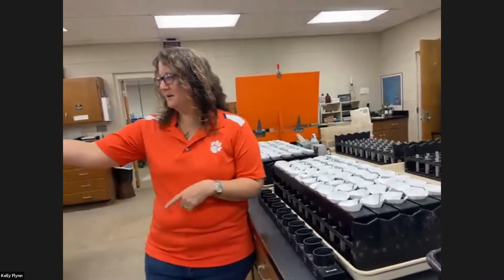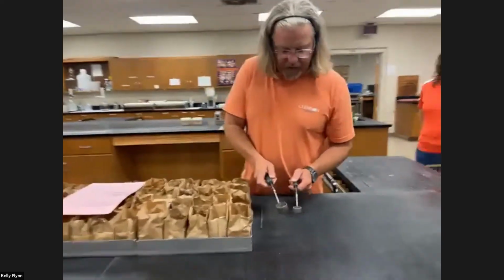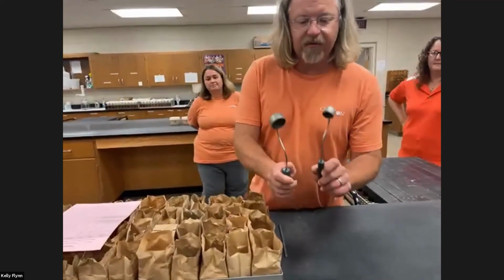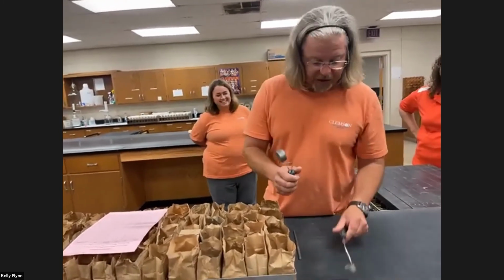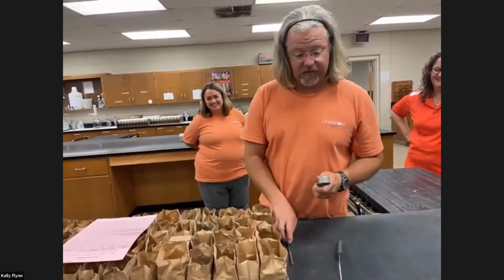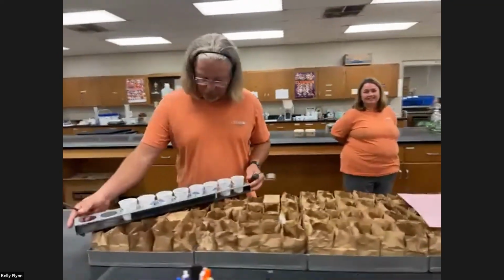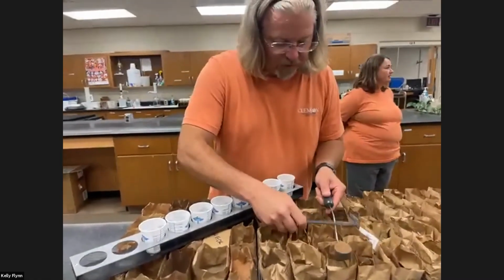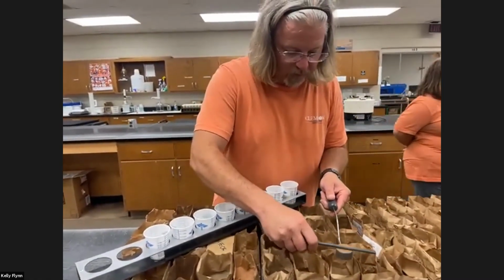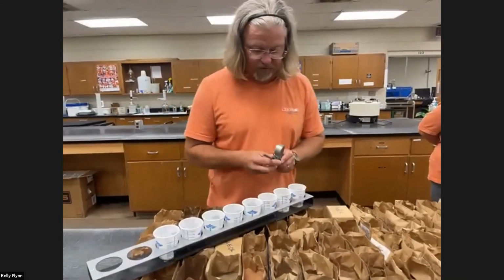Okay. So we go back over to where we were with our soil samples. Once again, and as Dr. Alford mentioned, there's 2 different sizes. One is for this mineral analysis and one is for pH. And these are standardized. This is what you'll find in every lab across the country, as she mentioned. So for pH, it's just a slightly smaller, larger amount. Smooth off and into these medicine cups.